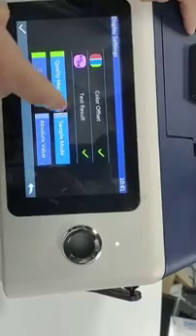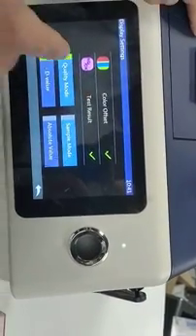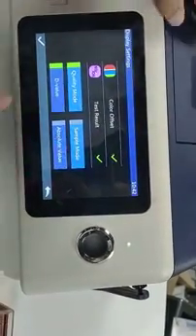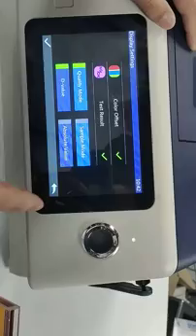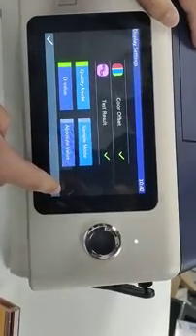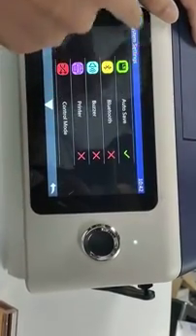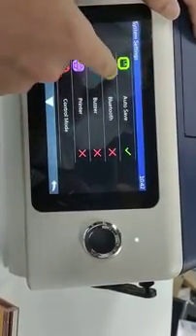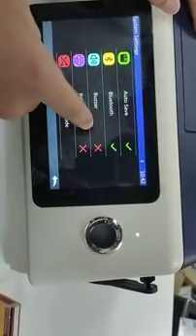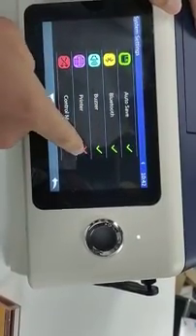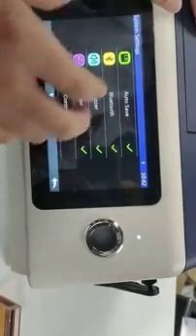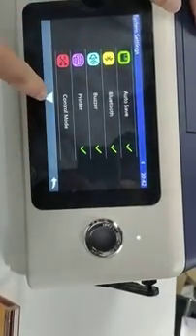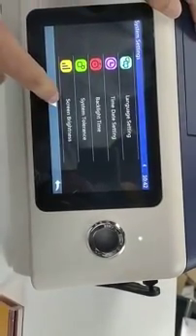Display settings. Color offset, test result. We all open them. It's about system settings. Auto save, Bluetooth. You can turn Bluetooth off or buzzer and the printer. If you need them, you can turn them on. Control mode.